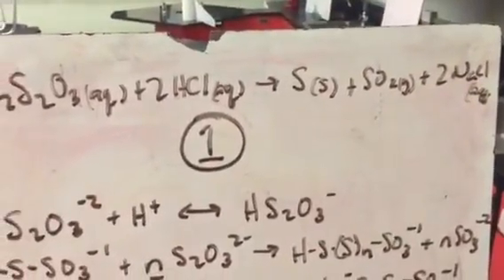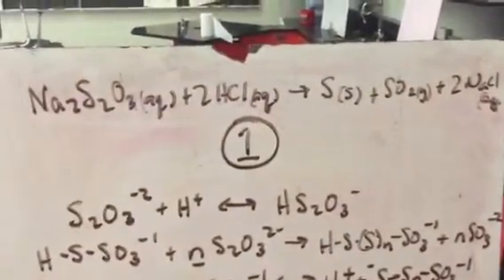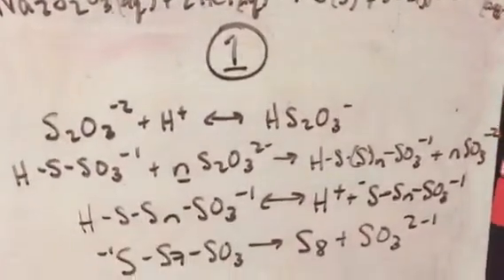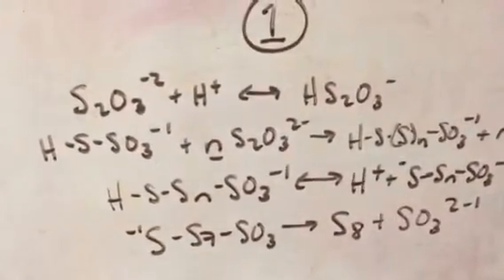Right away, you think, hey, that's going to smell bad, but this is why we're doing it on a microscale. And this is a rate study. What's going to make this speed up and slow down and go faster? Now, it looks like it's simple, but really, we think we have all of these reactions going on. And this is crazy, right?